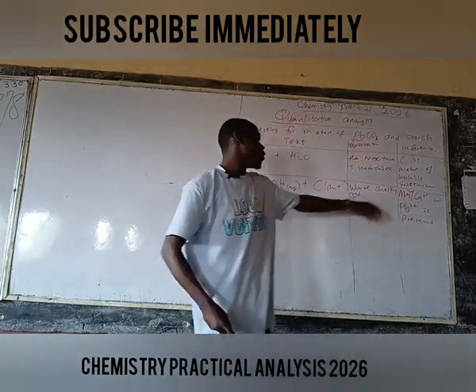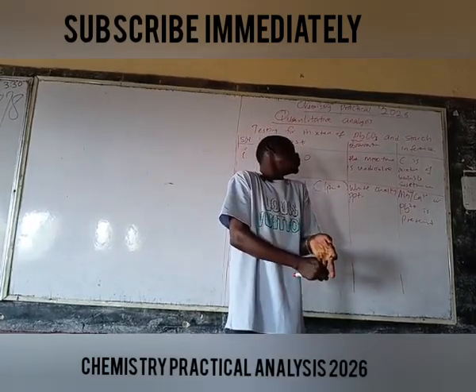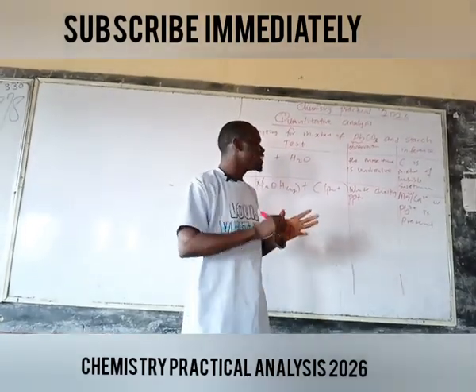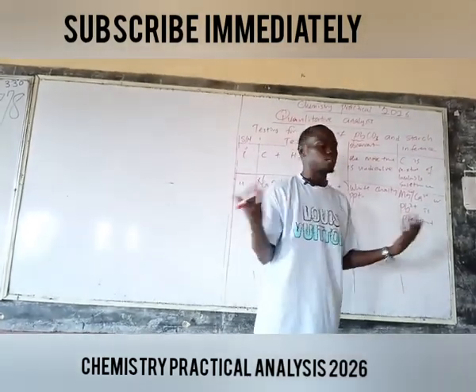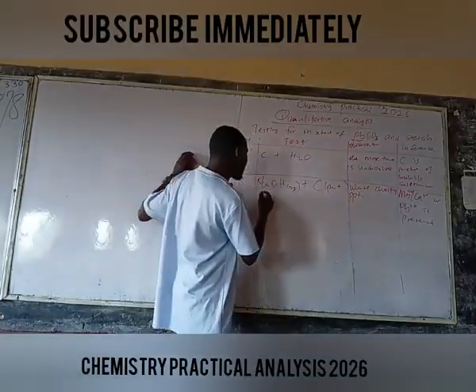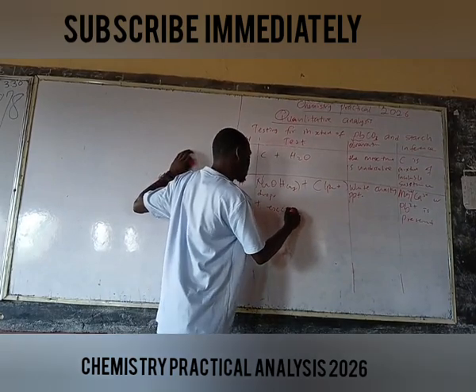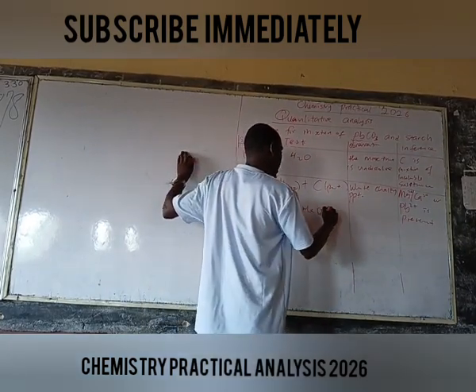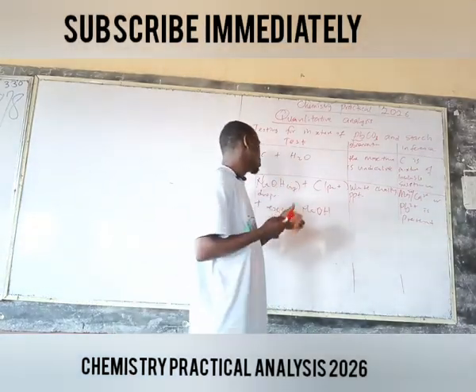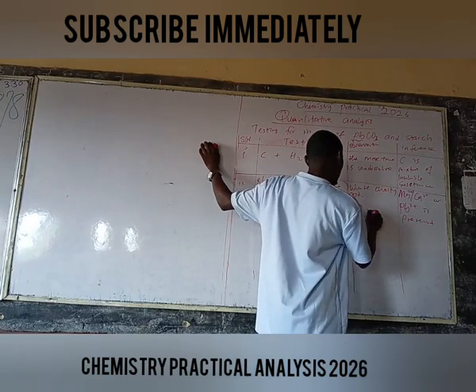Now, although we have zinc and aluminium with very similar characteristics, zinc and aluminium will only give a gelatinous white precipitate. But once we have a chalky white precipitate, on adding it in drops, then in excess, plus excess sodium hydroxide, you are expected to have the precipitate dissolve.